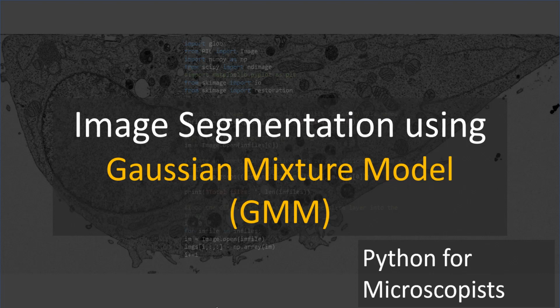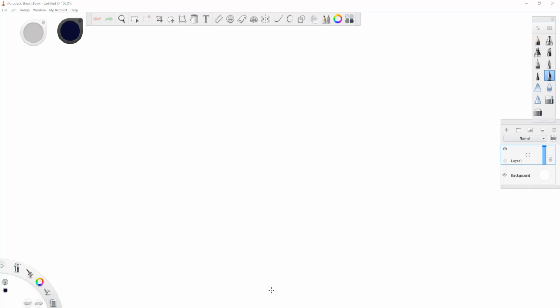So before writing any code, let's understand what Gaussian mixture model does, and I will stay away from using any equations. Okay, for those of you biologists or even material scientists who are not comfortable with equations. If you really want more information, obviously go ahead and Google search, or even on YouTube, there are excellent videos that go in depth about Gaussian mixture model.